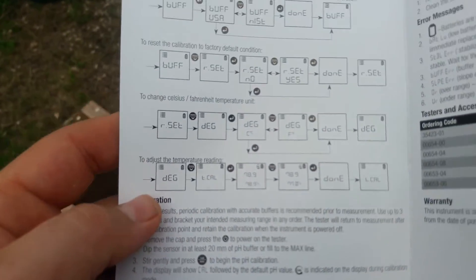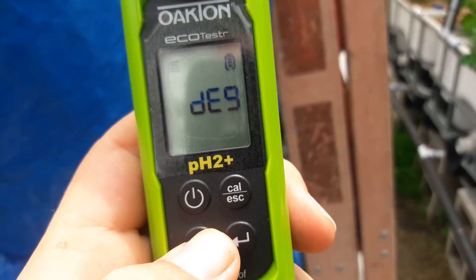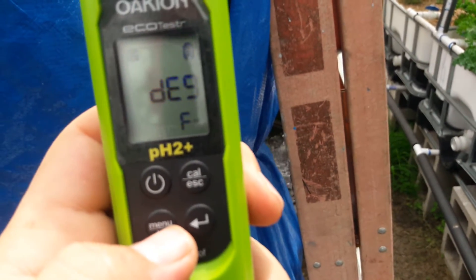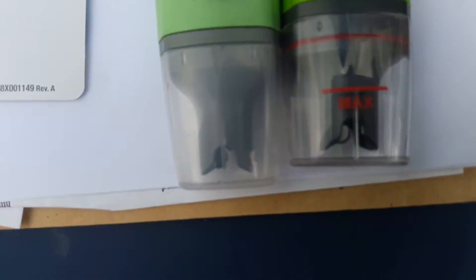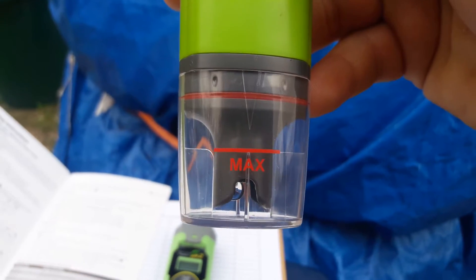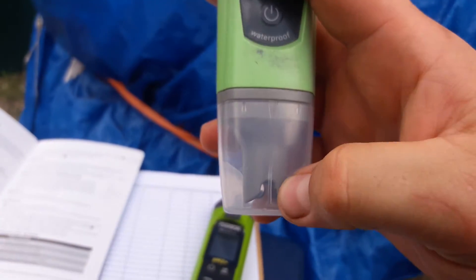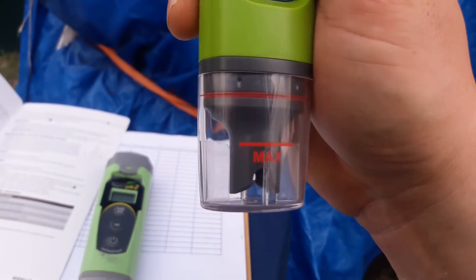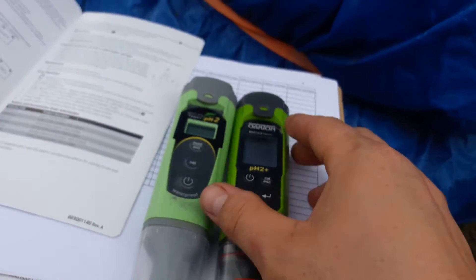To set the temperature units, you hit the menu button until you get to degrees. It shows Fahrenheit by default; if you want to change it to Celsius you just hit the down button, and back again for Fahrenheit. This model now has a max fill line, so you know exactly how much liquid to add to make sure the electrode is completely covered for accurate pH testing.